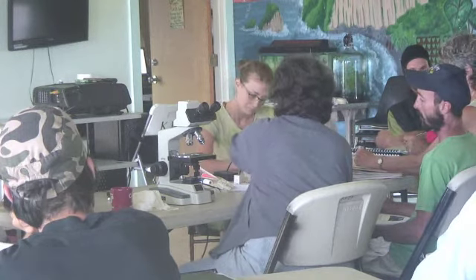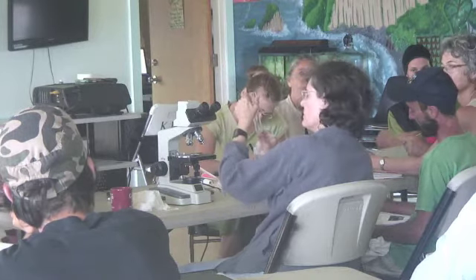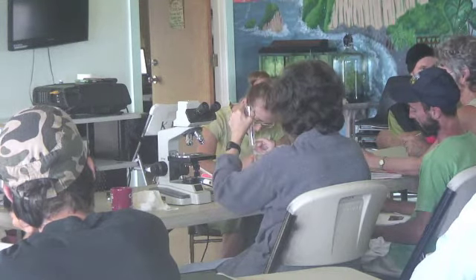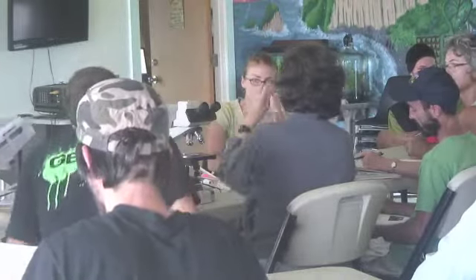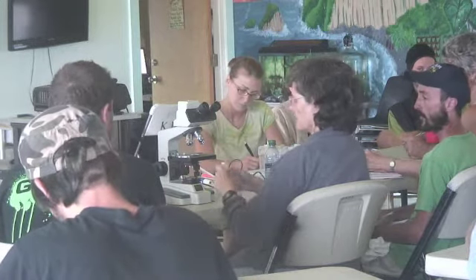But then here you can just pull this up to the 5 mL mark and then put that into your tube, so your soil is in there, put the water in, pull up another 4 mL because you've got 1 gram of sample, 5 mL of water, you'll want to be adding 9 mL of water to get a 1:10 dilution. And then put the cap back on your sample. And then just like I did with these ones, shake for about 30 seconds.